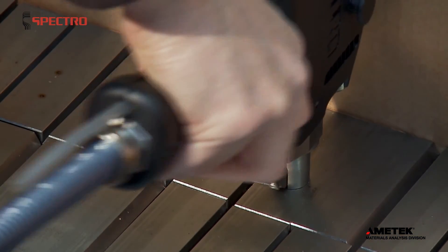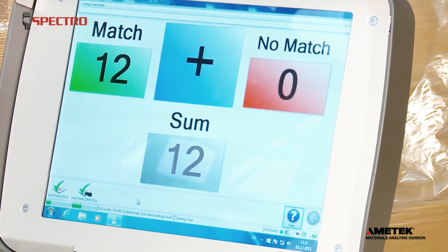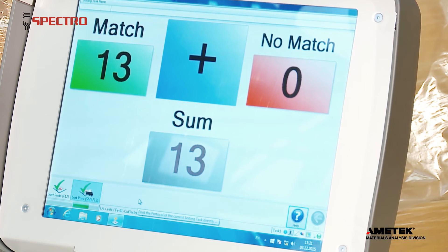Pass-Fail Sorting offers the fastest possible way to test hundreds or even thousands of samples in quick succession. As long as you're within defined limits for critical elements of the alloy, you see a match.